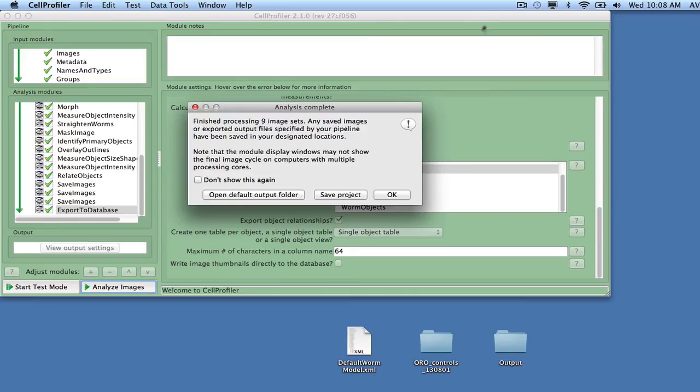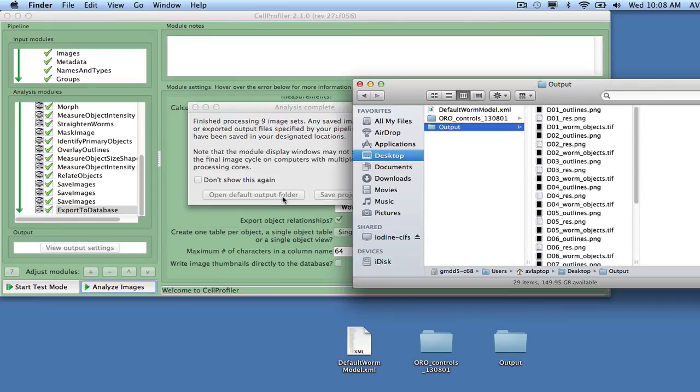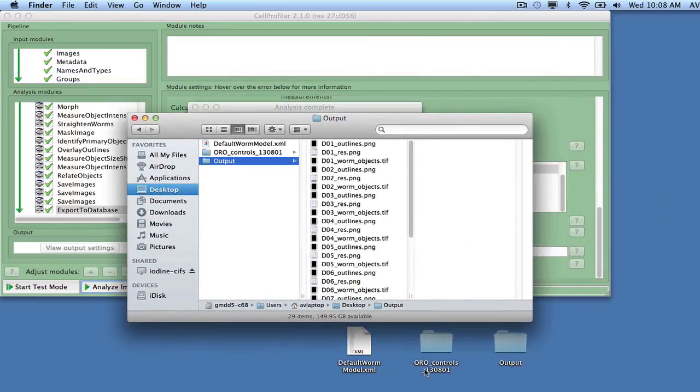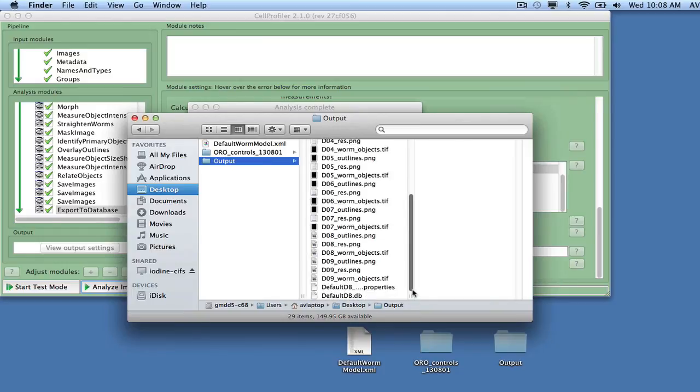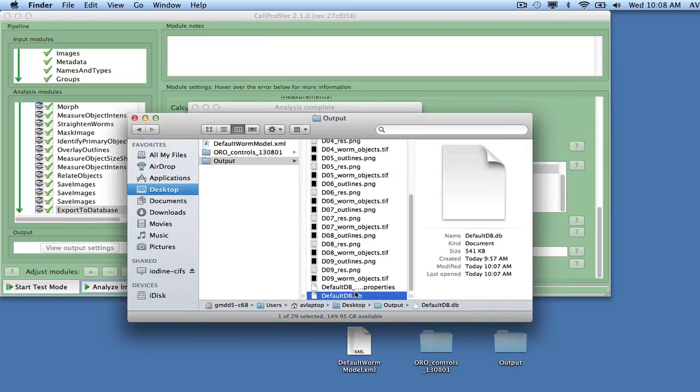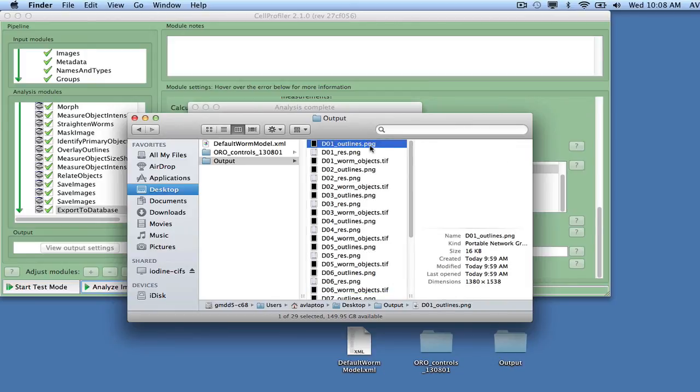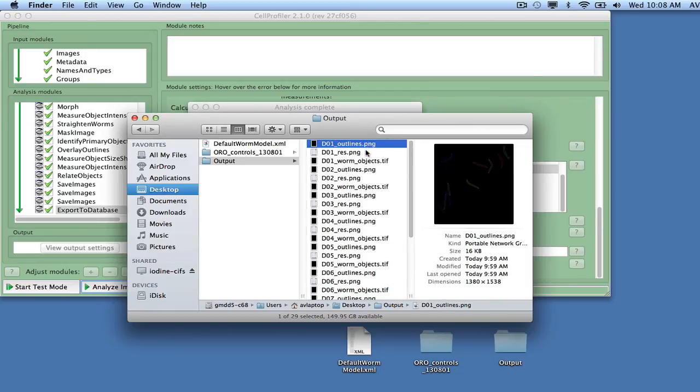The output will be an SQLite database with measurements, a properties file for Data Exploration in CellProfiler Analyst, a set of images showing outlines of worms and fatty regions on top of the raw data, a set of images with outlines only, and a set of segmentation masks describing the overlapping worms.